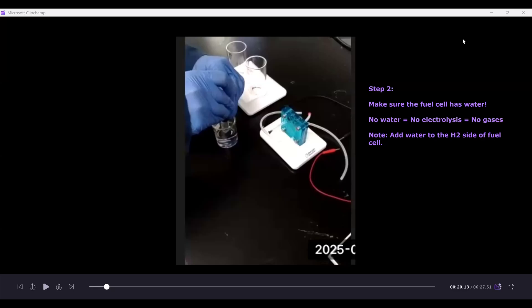Step two is to make sure the fuel cell has water in it. No water equals no electrolysis, which equals no gases. This is a very common issue in this experiment — forgetting to add water to the fuel cell. Water goes in on the hydrogen side, which is the side labeled in black. You add water until you see water coming out on the other side through the tube with the red cap; once you see that, you know you've added enough.